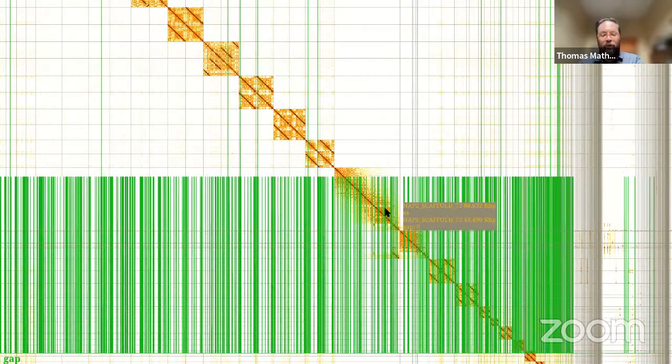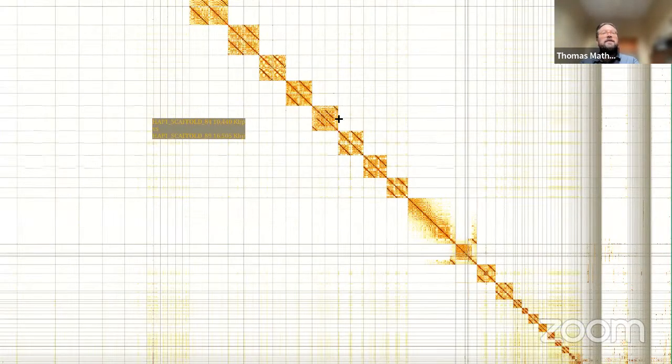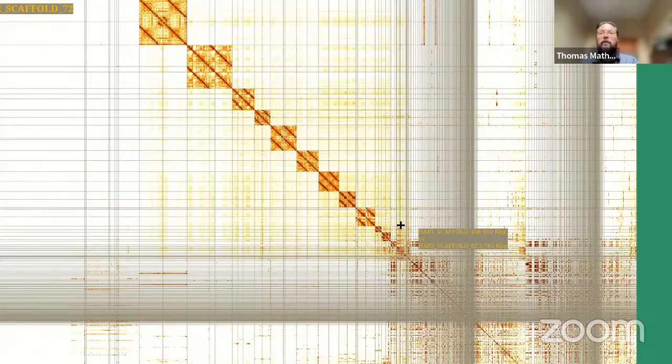Okay, so if anybody has any questions, please speak up. It's not the most straightforward thing to do, but we've identified some small chromosomes already. We've got a bunch of content here which looks like it might be a chromosome, but is quite difficult to work out exactly what's going on with it. There's other small bits here. What I'm going to suggest now is you go into the Git pod.